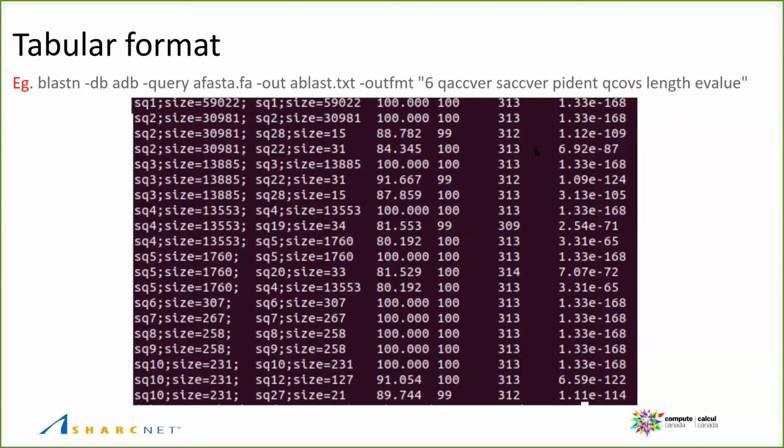And the other very, very common format is the tabular format. So basically a table, right? Normally, a lot of people like Excel, so they are more familiar with the tabular format. So basically you have some fields that act as columns and are separated by a character. It could be a tab, like in this case, or it could be a comma, if it's a comma delimited file, or basically any other character that we want to separate the columns.